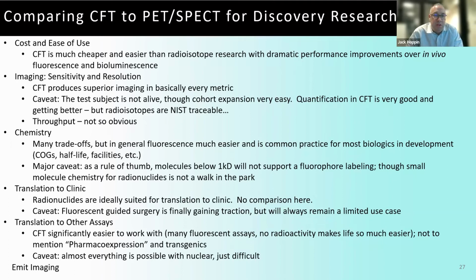In terms of imaging, sensitivity and resolution, and I'll address throughput, CFT produces better images in basically every metric. You saw that we could make very exciting C14 images, but it's a non-trivial task. And that's a caveat I'd say here, that you can do almost anything in nuclear, but it just might not be easy.